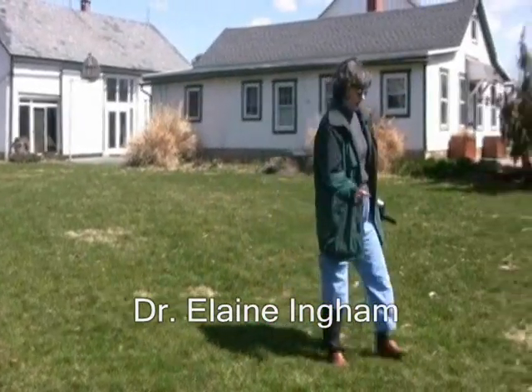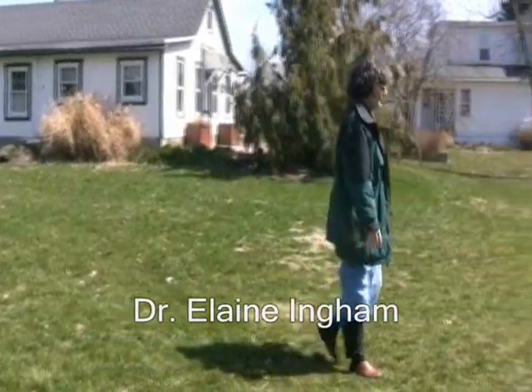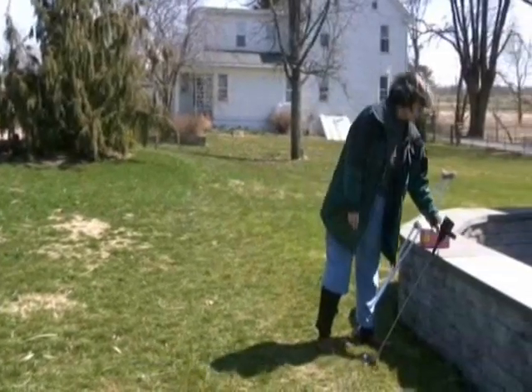When we start looking at how we are going to actually sample this soil for the biology present in the soil, we're going to go over and get a slightly different instrument.